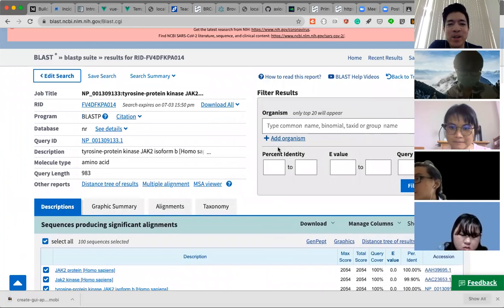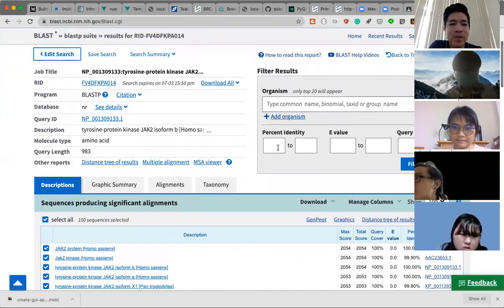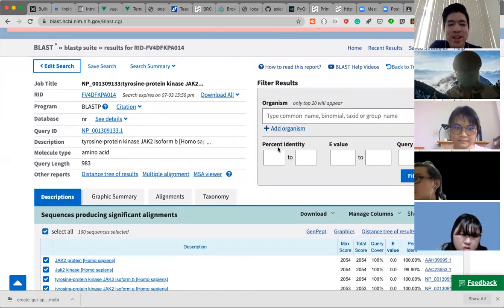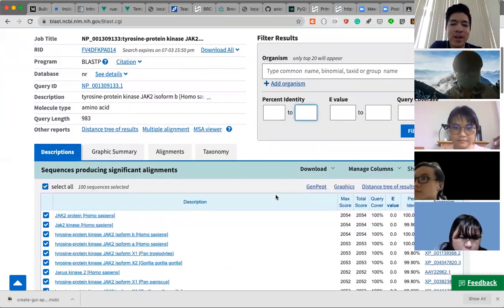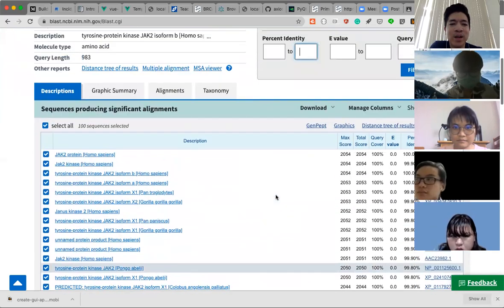Okay, you can look at my results in the meantime, to wait until your result comes up. This is my result, and you know what? It changed a lot from last time I looked at the result page. Nowadays you can filter, you can do so many things that you couldn't do before. So this is quite new to me as well. I mean, the look of the page is new.